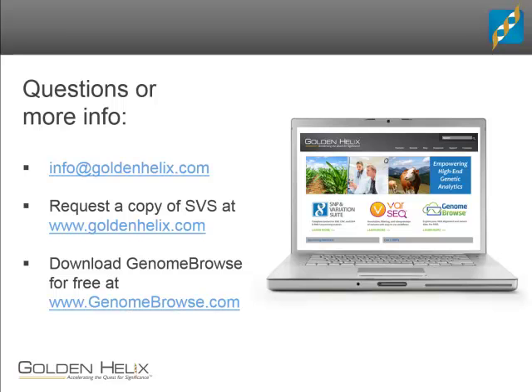Is 1000 Genomes phase 3 data for all chromosomes available in SVS now? That's coming. We're working on updating a lot of our annotation sources, so keep watching. It'll be coming out soon.